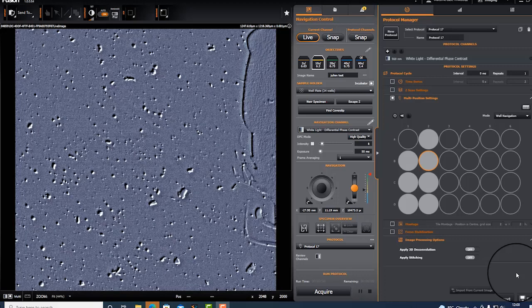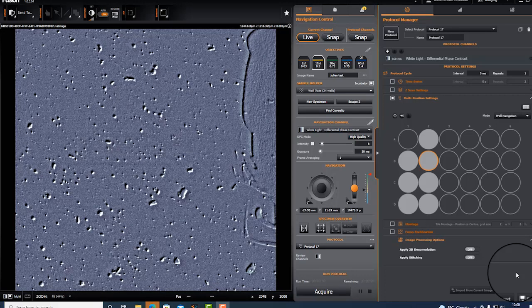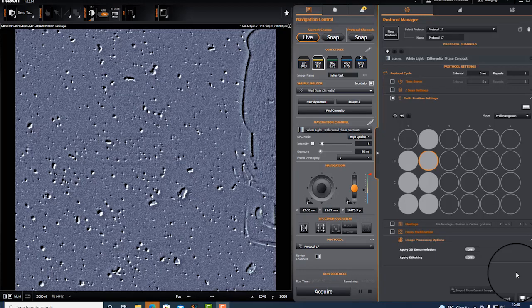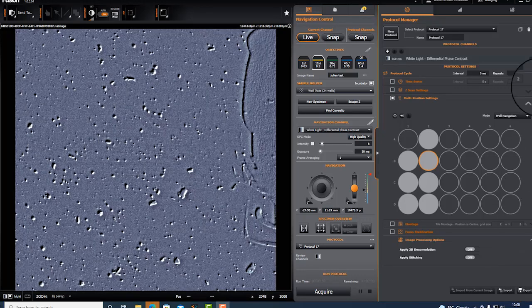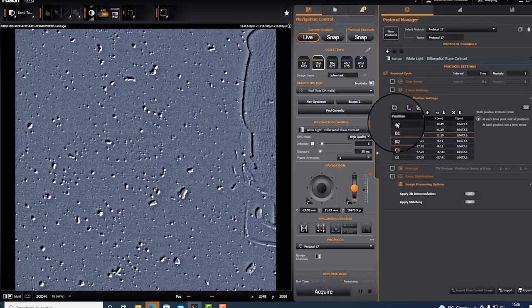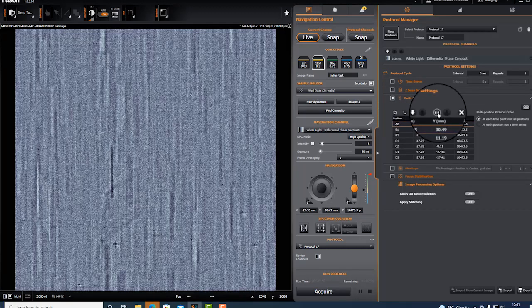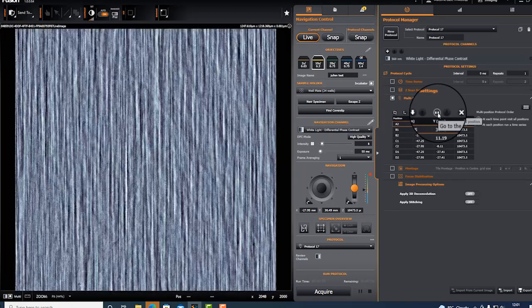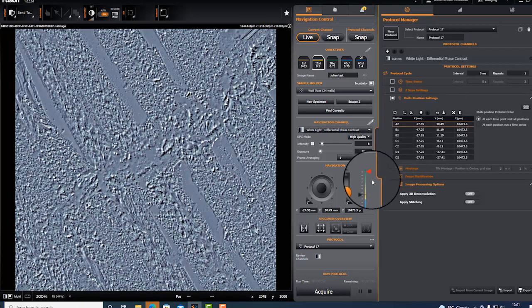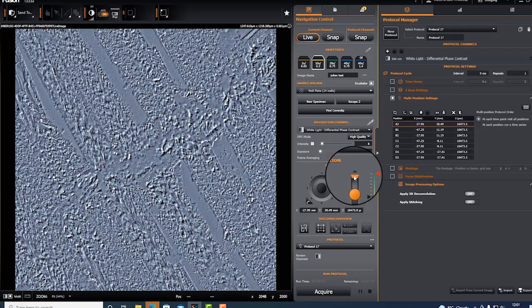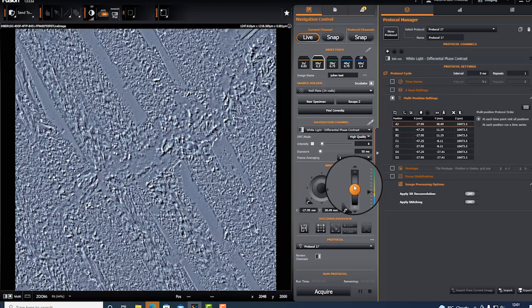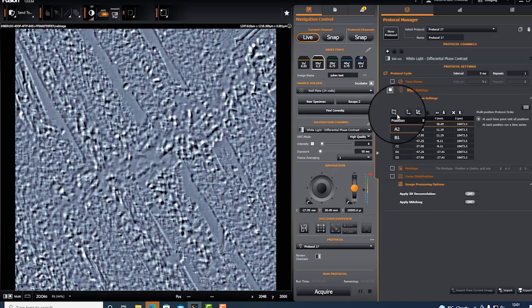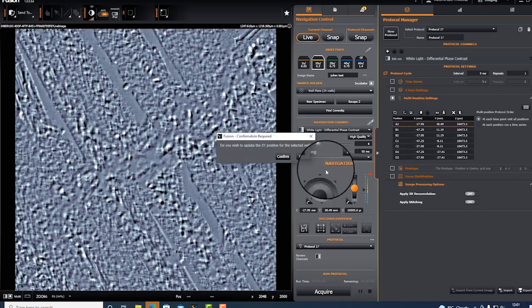If you have live samples, chances are your focusing plane is different in different wells and you might want to adjust that. You can go to the table view, go to the well you want, or go well by well and readjust the focus. Let's bring it out of focus a bit and then replace position.